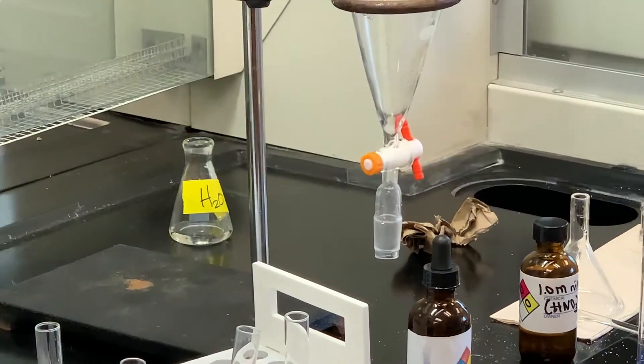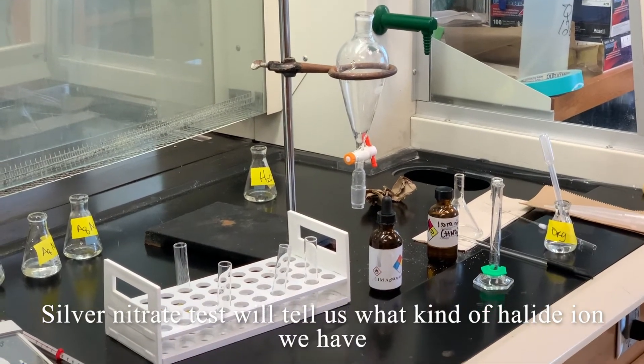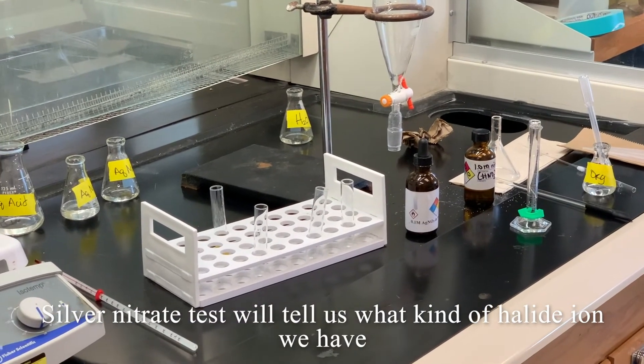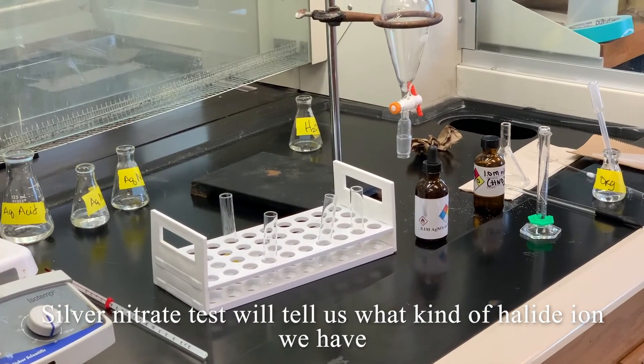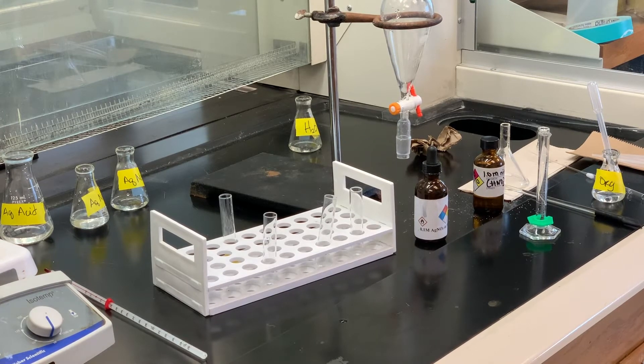Now we're going to do another chemical test that will hopefully tell us what type of halide ion we have. We're going to use the reagent silver nitrate in ethanol — about two milliliters of that into a test tube — and then add a couple drops of our sample. What we're looking for is a precipitate fairly quickly. There are several halogens you can have: chlorides, bromides, or iodides.